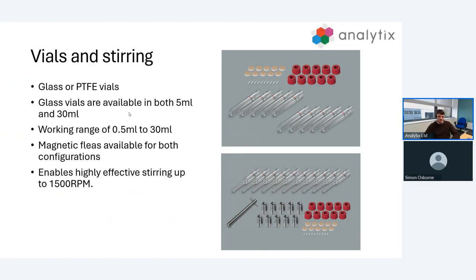You'll notice that the 5 mil vials have a narrower base. In order to maintain good conductivity between the heating jacket and the sample, we use a metal adapter as you can see in the rings in the bottom of the picture. We place these adapters in each of the reaction cells and then place our vial in there. There's really good connection and good heating control. Using the tool, we can simply pull these out when we're ready to use the 30 mil vials instead.